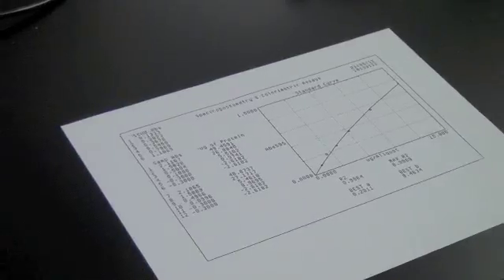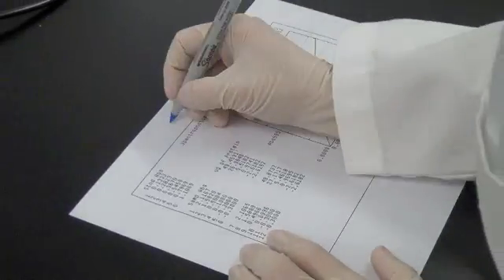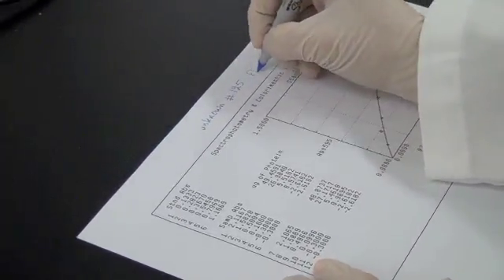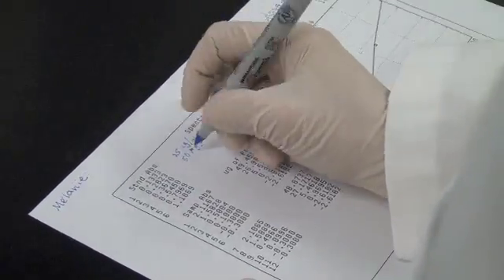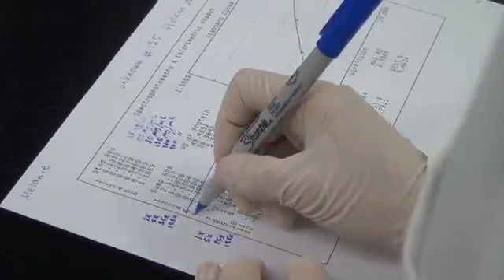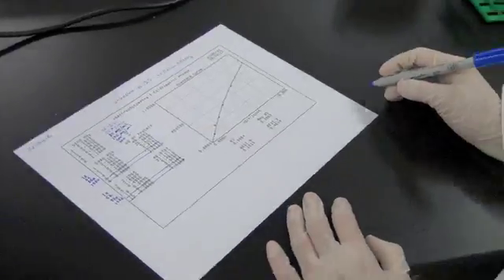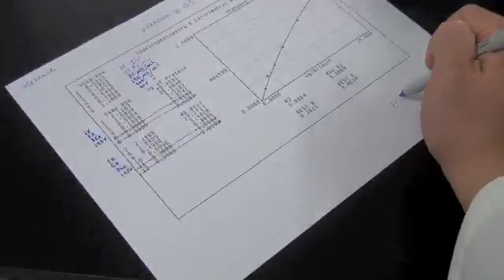Now it's time to label the data printout. Be sure to write your name, section, title, and any other necessary annotations that identify the values listed on the printout. You will also be required to have your lab teacher initial your data, as this helps to ensure that your TA has witnessed your performance in lab.